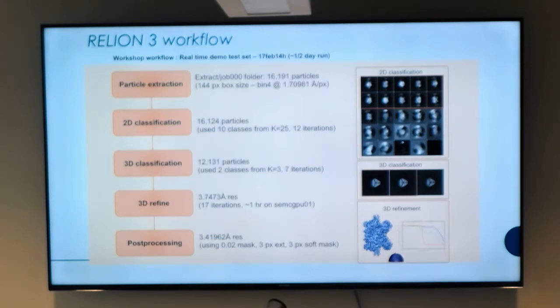And you can see, again, this was accelerated because we didn't use so many iterations. So this shows you where you can really cut down on the number of iterations and have some feedback, right? And this is not to say that this is going to be your final reconstruction, but this is quite a respectable reconstruction that you can make use of to really start. You can do initial model, like PDB docking. If you already have a model, you can see how well this compares and contrasts to certain things.